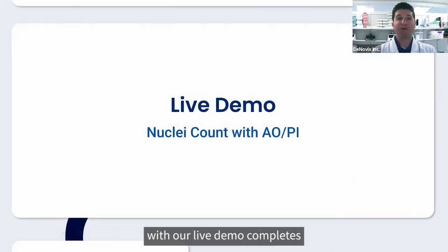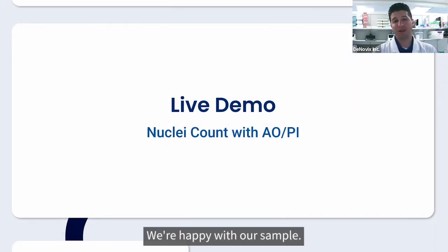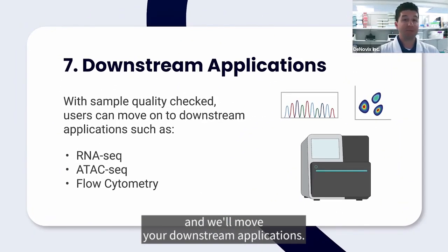So with our live demo complete, our nuclei isolated, purified, all of those considerations, we're happy with our sample. We're happy that it is a high quality sample based on all the analysis we've been able to do on the Celldrop, and we'll move to our downstream applications.